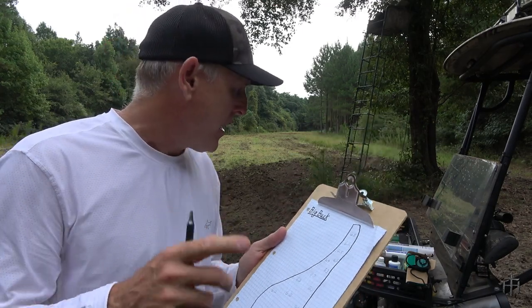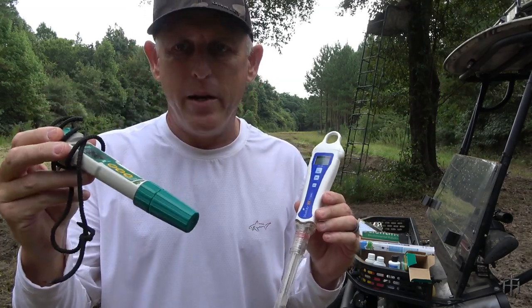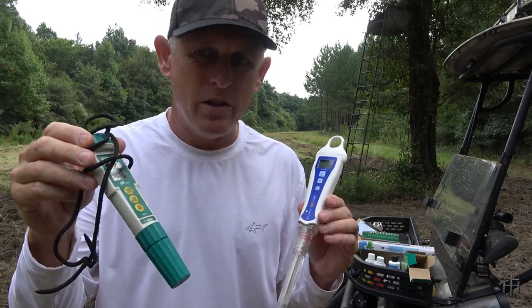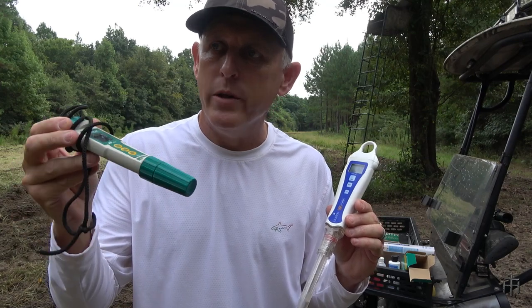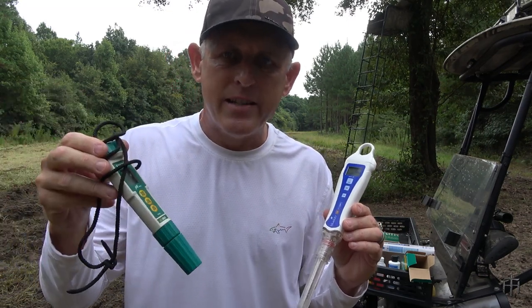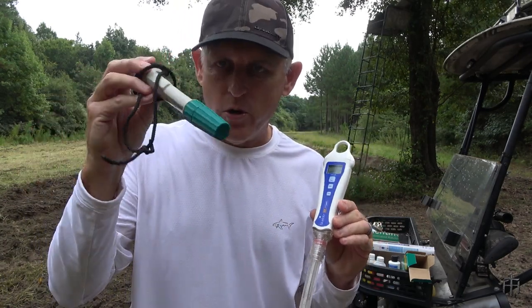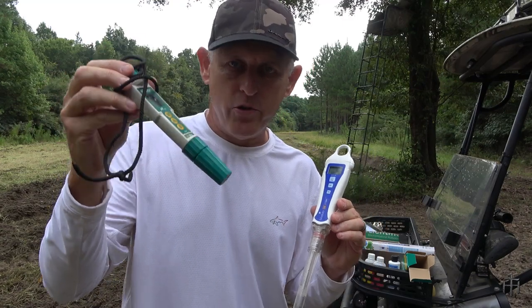Let me show you two pens. This one is like a dinosaur — I've had it for many, many years. It's much slower and cheaper; you can get these for about 50 bucks on Amazon. This is not a soil-specific pen, it's just a pH tester. I had to create a little slurry, let it sit for about three minutes, then test it. It just took a lot longer. To me it's also not nearly as accurate as the newer one.